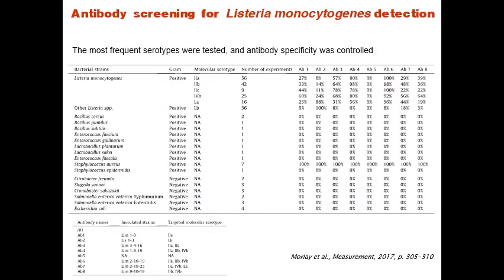I guess you understood that the detection of bacteria on SPR biochips strongly depends on the antibody efficiency to specifically bind surface antigens. In the framework of a collaboration with the Prestodia company in Paris, in France, several rabbits have been immunized with different Listeria strains to produce polyclonal antibodies, hopefully specific to the molecular serotypes characterizing the inoculated Listeria.